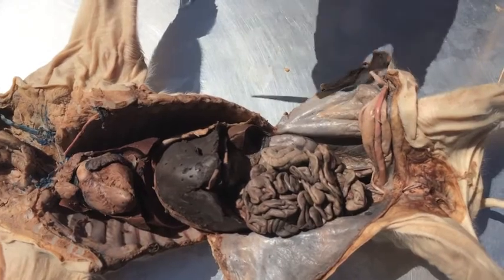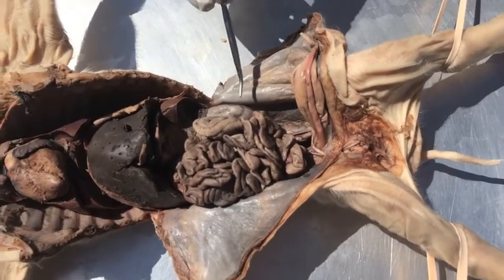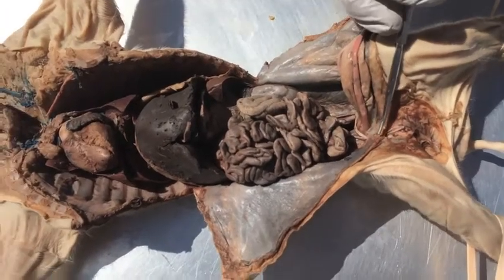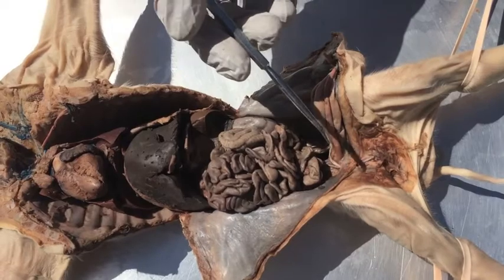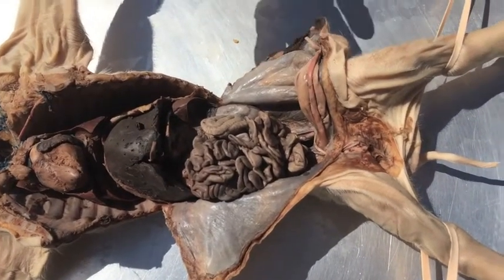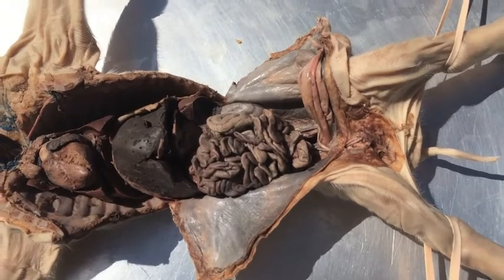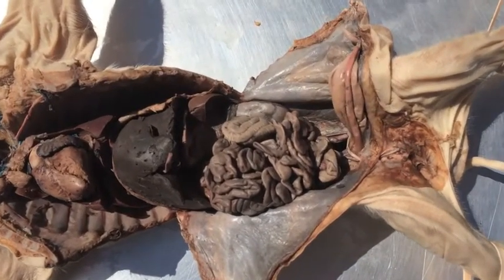And then we have the testes, which are located here, which produce testosterone. The ovaries, which would be in a female pig, produce estrogen and progesterone. And then the uterus, of course, which isn't in this pig also, but receives the embryo and fertilizes, but it's obviously not in this pig because it's a male.